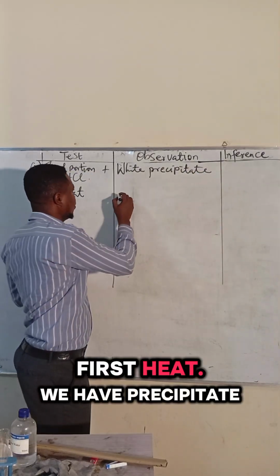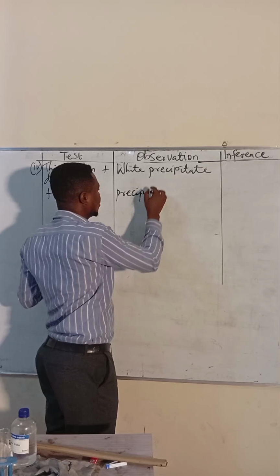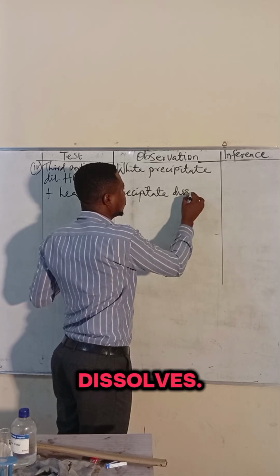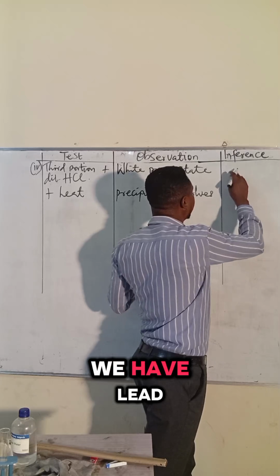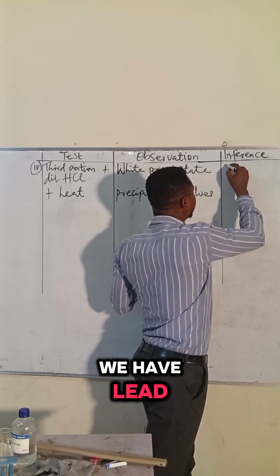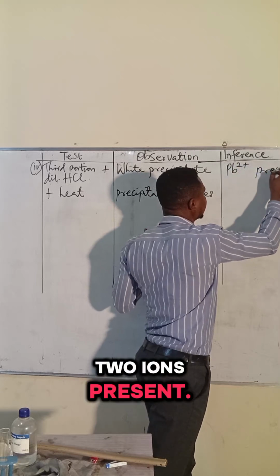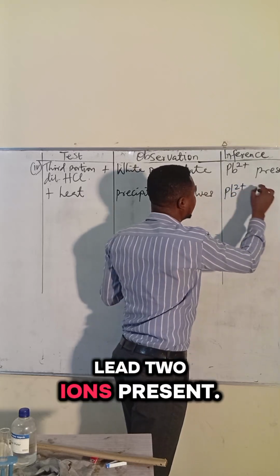Plus heat. We have precipitate dissolves. We have lead 2 ion present.